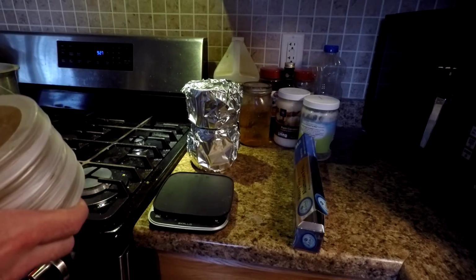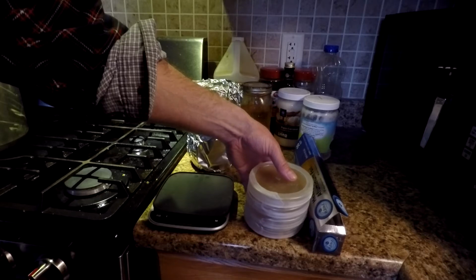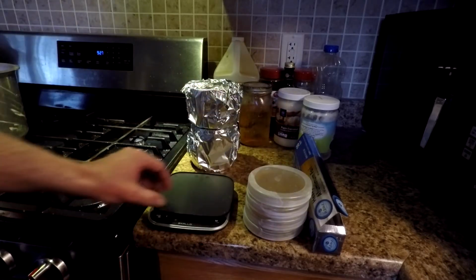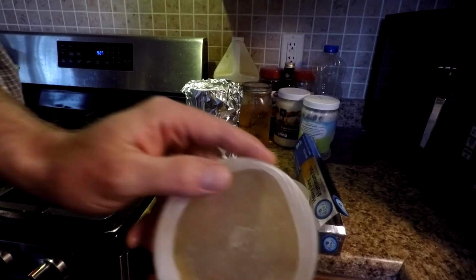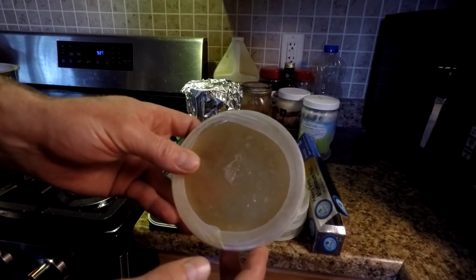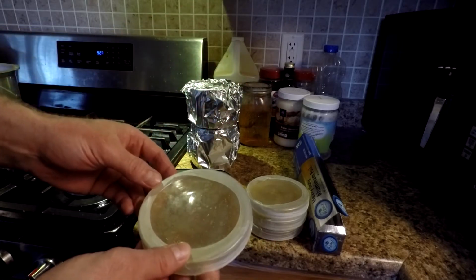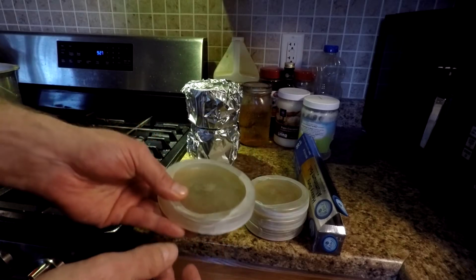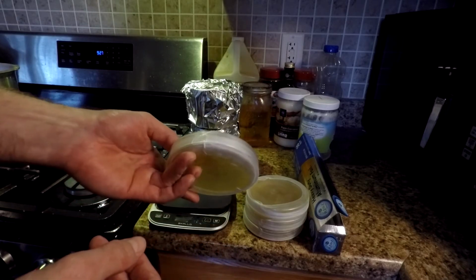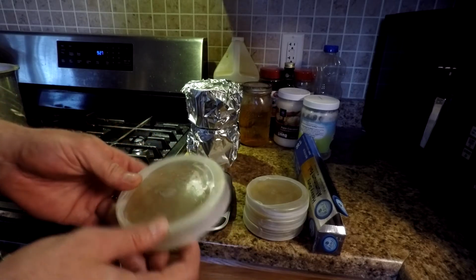I have to make conditions a bit better for the mycelium and a bit worse for bacteria, which means I have to get a lot of this condensation you see out of the jar, or out of the dish rather. And that too, using a spore syringe, you're adding water to the dish too, so any standing water in a dish will give it a little bit of an edge to the bacteria because they like overly wet conditions.